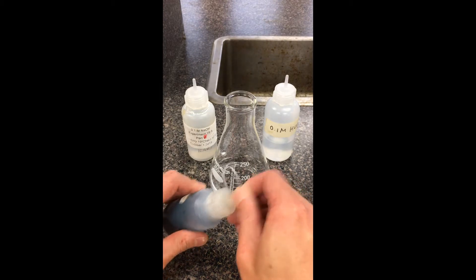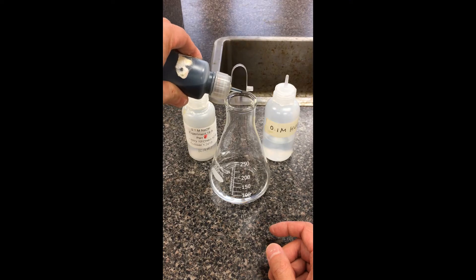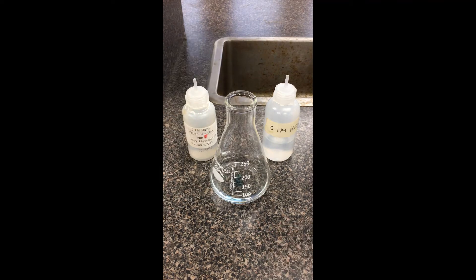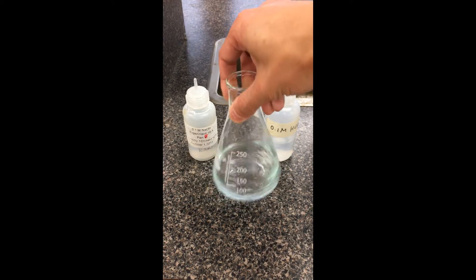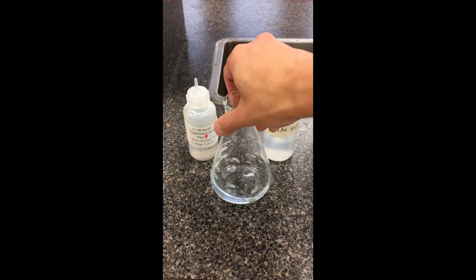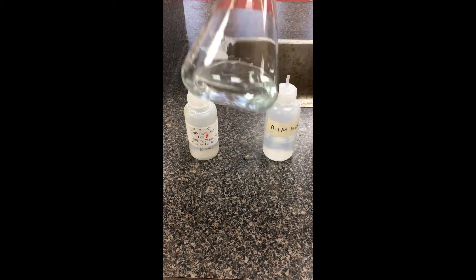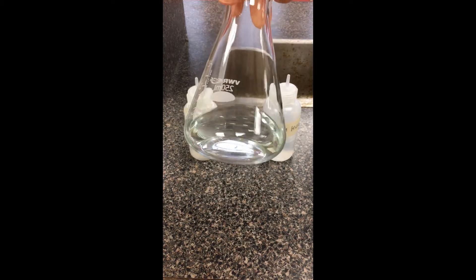I'm going to start off by dropping the indicator inside. The exact amount doesn't matter, although you don't need a ton of it — I'm going to add about five drops to make the color change more dramatic. Anytime in this lab they ask you to count drops, we can approximate twenty drops from these dropper bottles as about a milliliter. So our solution is starting off as a tone of blue color.